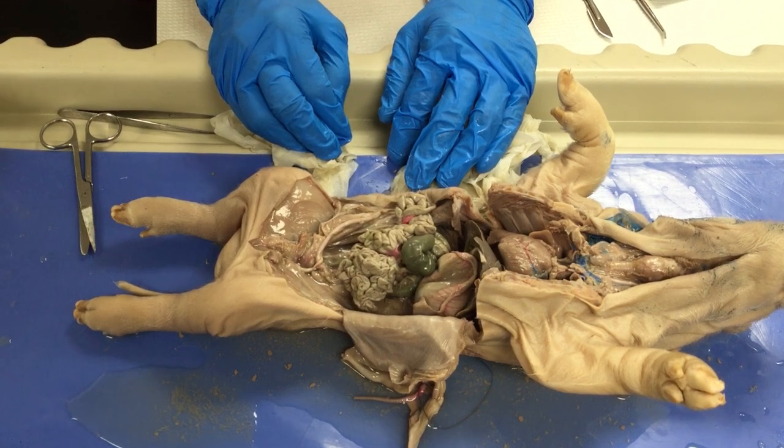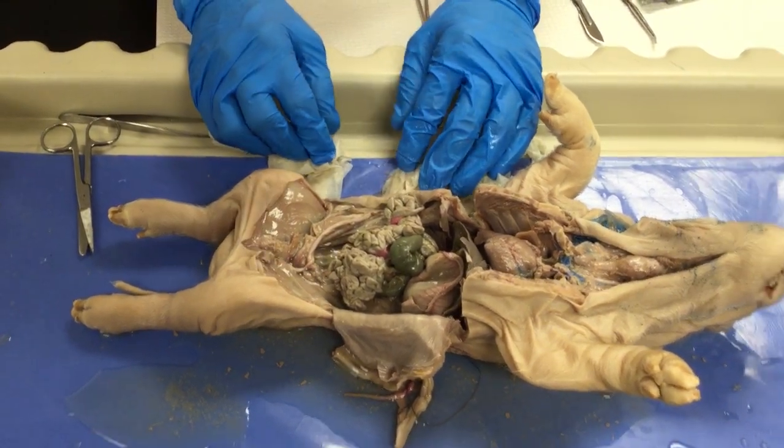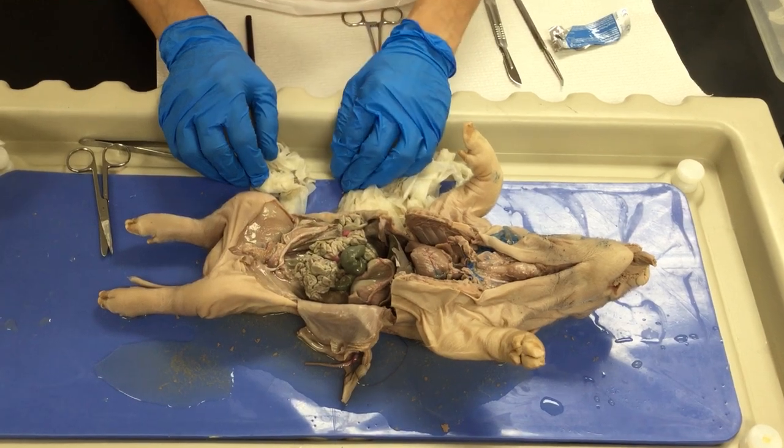This is all for this video. You were able to see most of the structures of the systems within the thoracic and abdominal cavity.